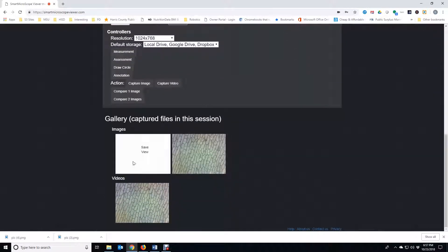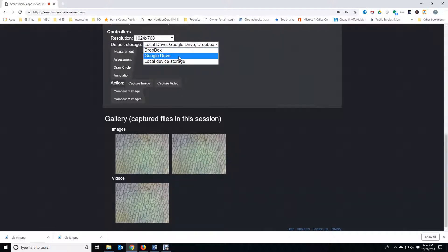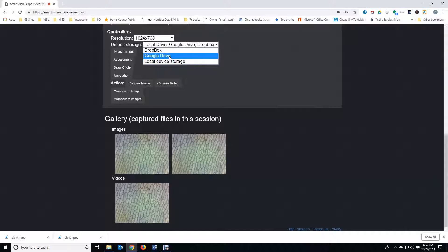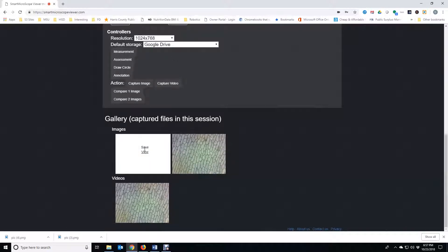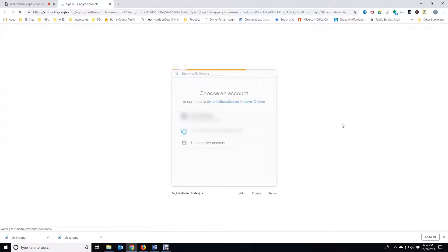Images and videos can be viewed in the gallery. You can view or save the gallery items. There are three save options: Dropbox, Google Drive, and Local Drive. We will choose Google Drive, which will save the images and videos directly to your Google Drive.